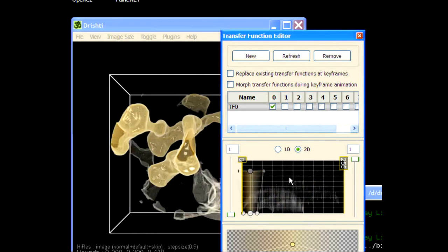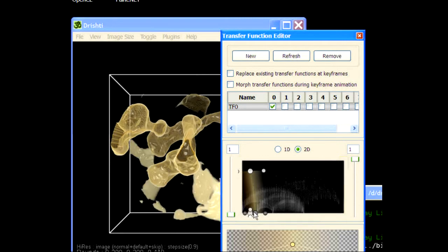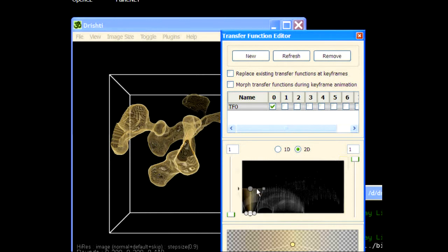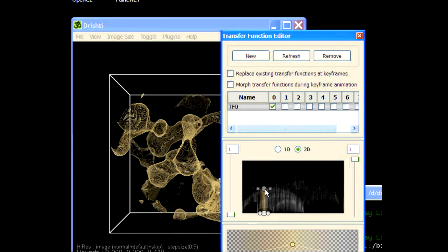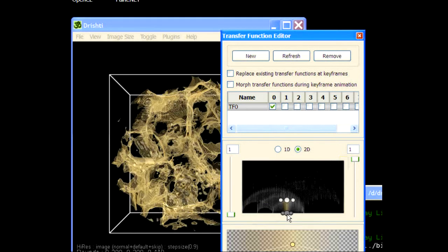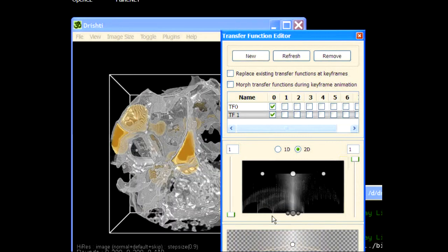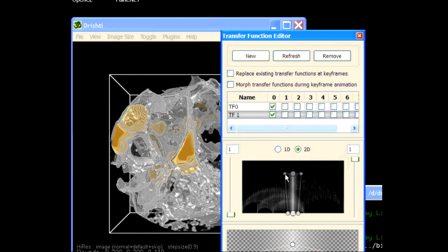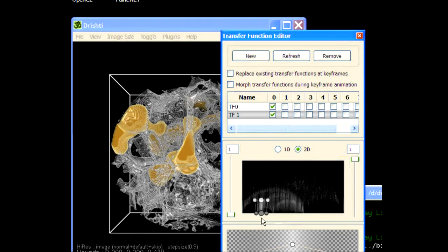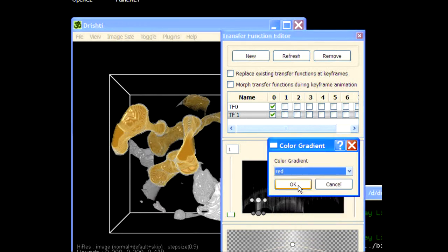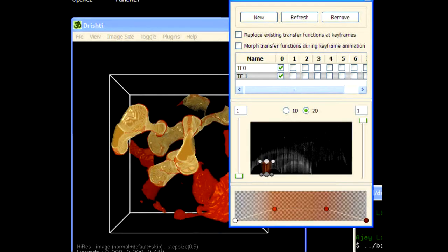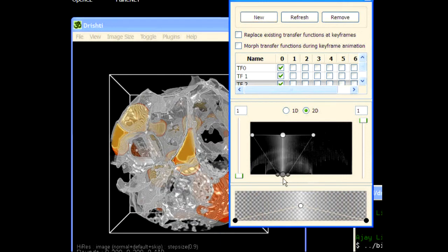Go ahead, so this one here, this one here, this one here, and so on. So that's how you can show your segmented data. You can show your segmented data, another one, let's say green.